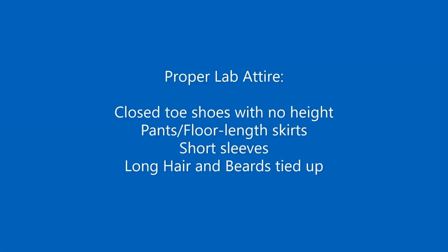Let's review some proper lab attire. You must be wearing shoes with closed toe and no height. This means no heels, no platforms, no Crocs, no peep toes, and no sandals. You must be wearing pants or floor-length skirts that do not have any holes. Short sleeves are preferred. If you have long hair, it must be tied back. If you have a long beard, it must be tied up.